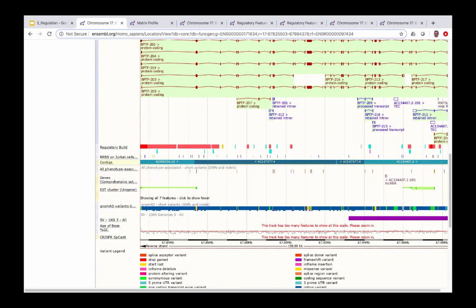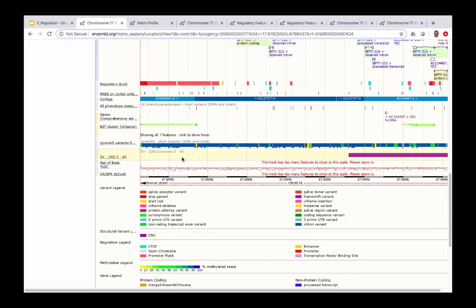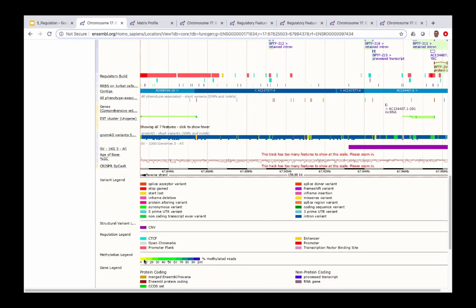After the page reloads with the new data tracks, scrolling down shows the regulatory build features as before, a track called RRBS showing the reduced representation bisulfite sequencing for the HeLa-S3 cells. The coloured bands represent different methylation states: yellow and green colours represent a lower percentage of methylated reads, whereas dark blue colours represent a much higher proportion of methylated reads.